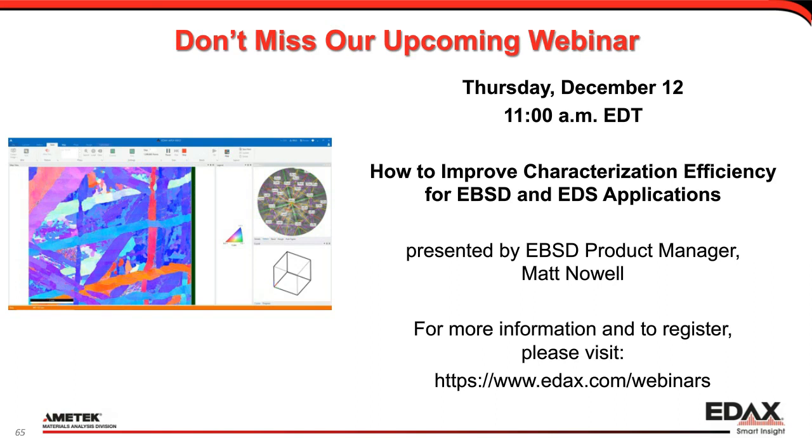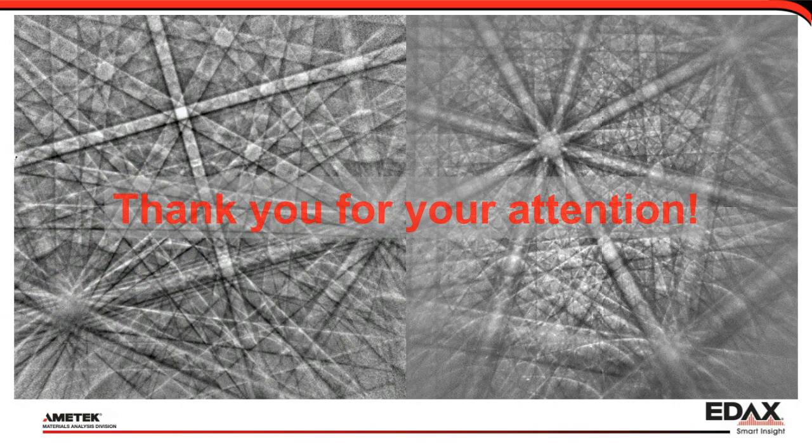So there is the last pretty pictures of the direct electron detector.